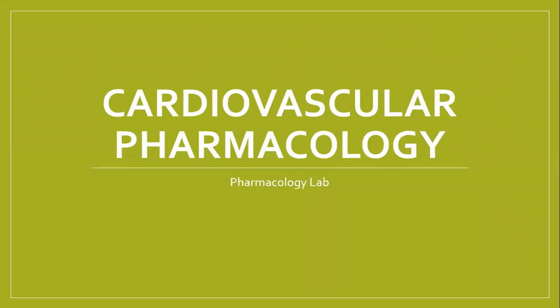Good morning, everyone. The next set of experiments that we are going to start belong to cardiovascular pharmacology. As we have studied earlier in the theory the various drugs which are used to treat various cardiovascular disorders, in line with that, we are going to study how the drugs are tested, and what are the different animal models available to test the activity of suspected drugs with cardiovascular effects.